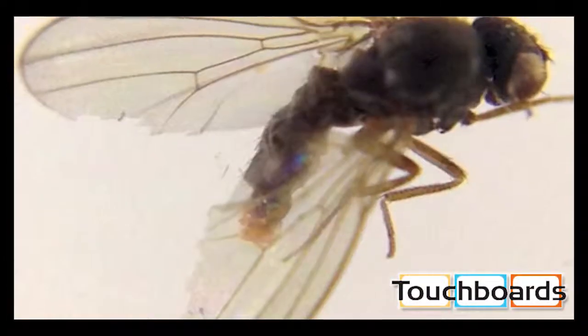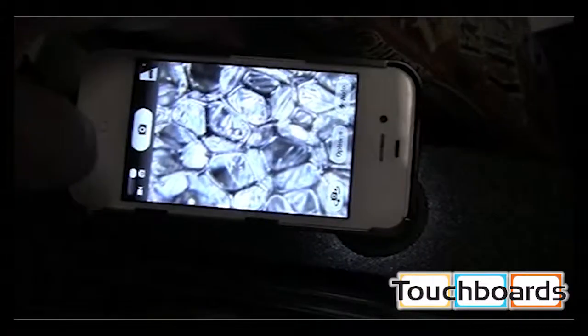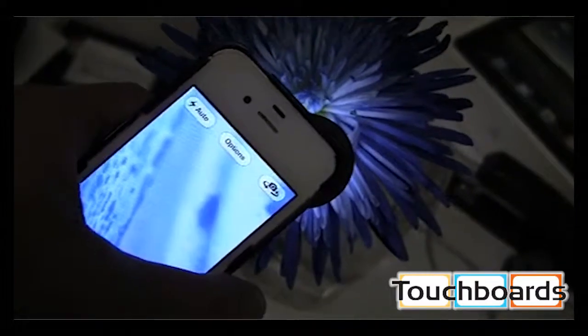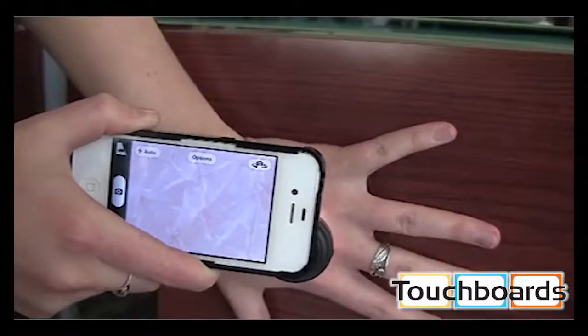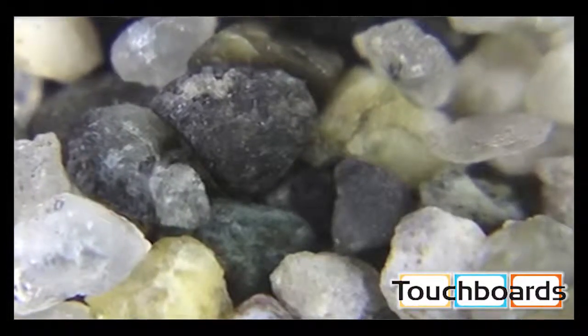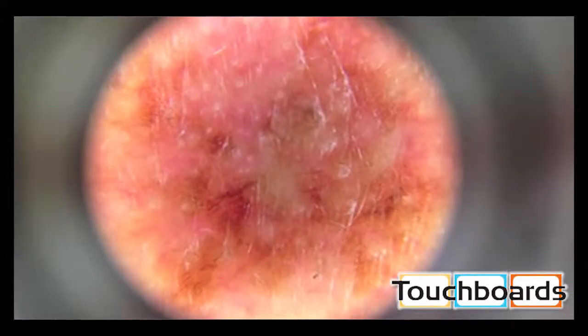This exacting quality and magnification mean that the focal distance is directly at the end of the lens cone, so you would contact the lens cone to the subject that you want to view. This not only makes the focal distance precise, but it's also designed to steady your iOS device for the super sharp image your iOS camera can produce.